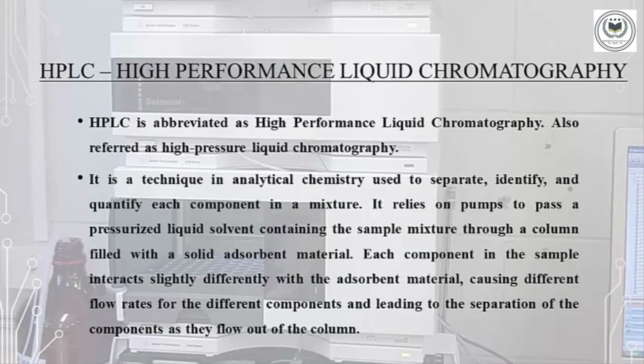HPLC is abbreviated as High Performance Liquid Chromatography, also referred to as High Pressure Liquid Chromatography. It is a technique in analytical chemistry used to separate, identify and quantify each component in a mixture.